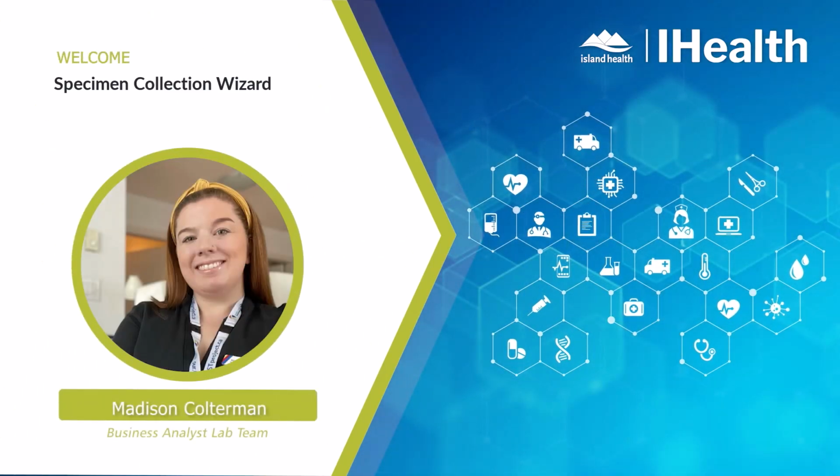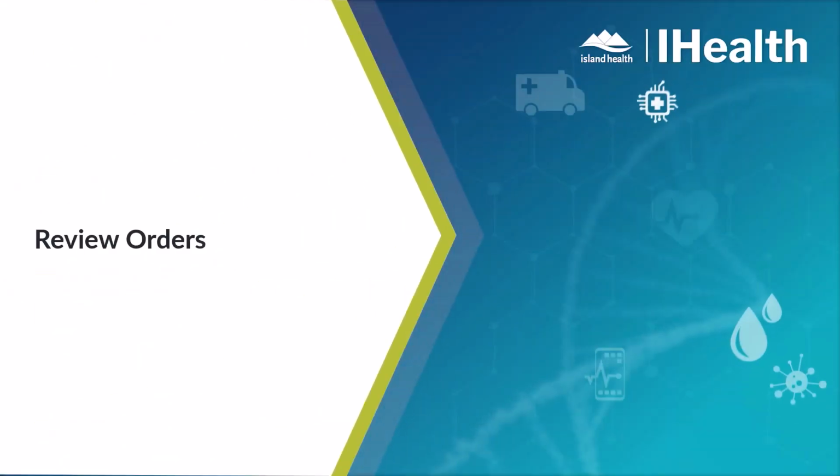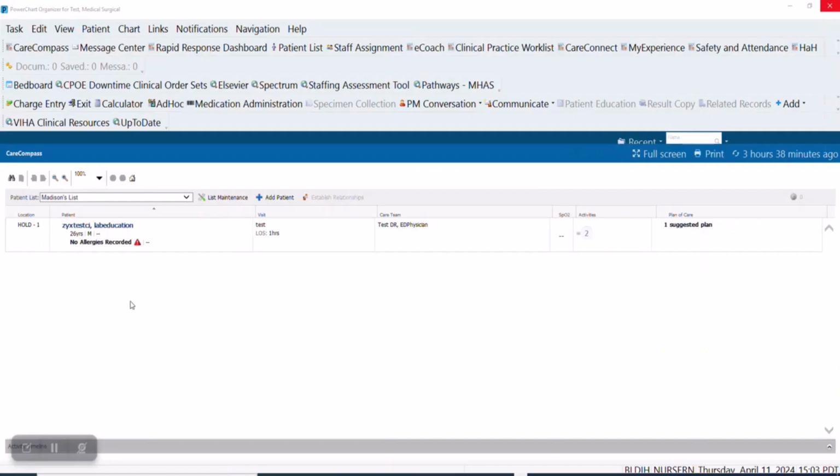This video will demonstrate how nurses can collect lab specimens using Specimen Collection Wizard. The first step in collecting a lab specimen is to review your orders. To do so, you'll navigate into your patient's chart.